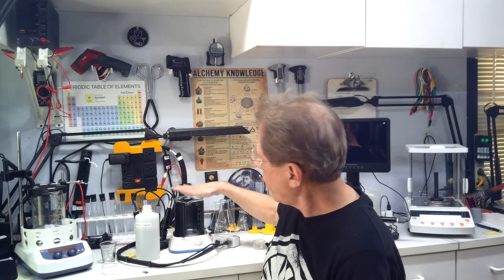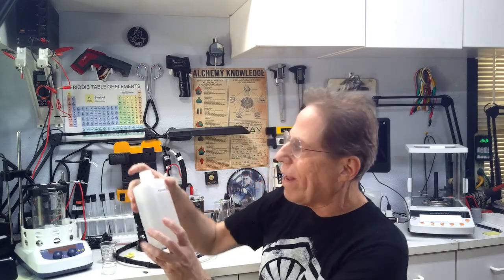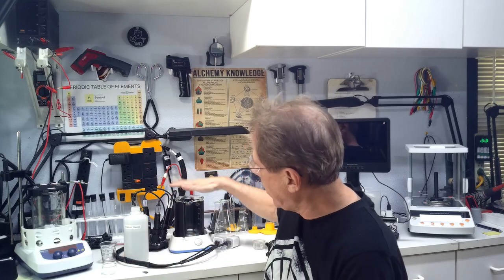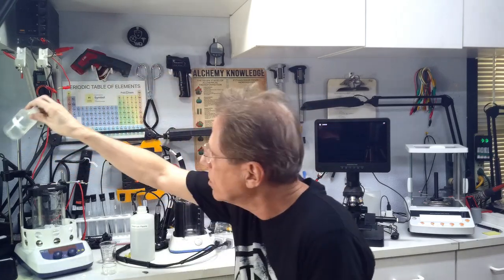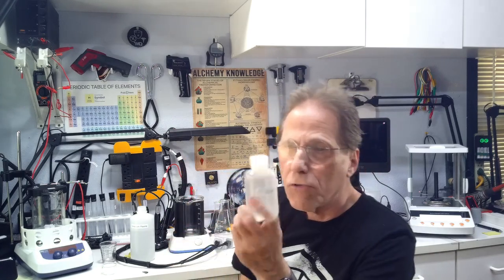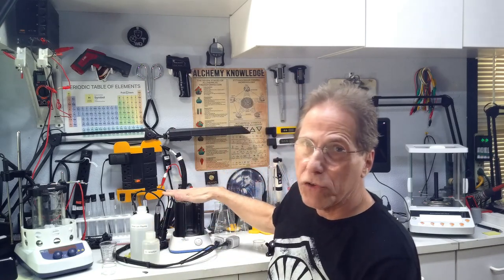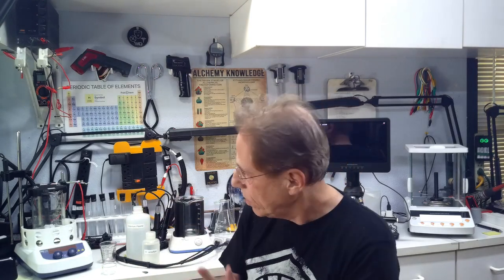Today I've got two things I want to accomplish. Number one, I want to start cooking more vanadium using the laser rig, right here. I have this plasma arc vanadium which pretty much didn't last — if you watched my last video on that experiment. So we're going to take what's left and mix it with the successful vanadium we made in the laser rig, which is only a small amount.